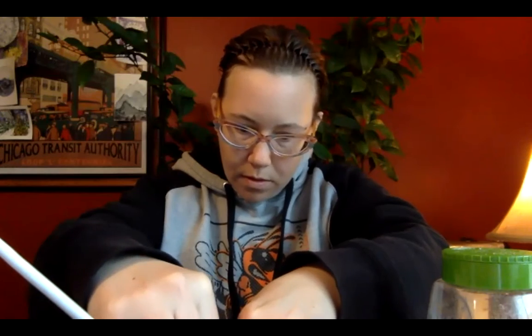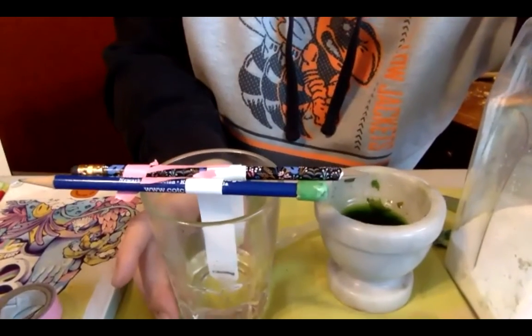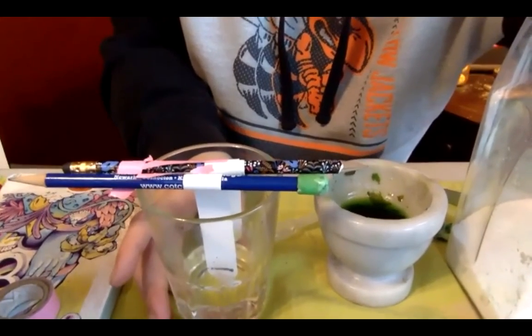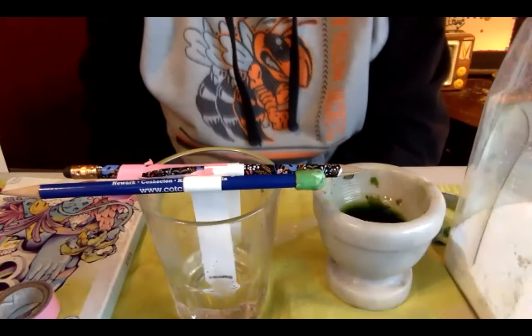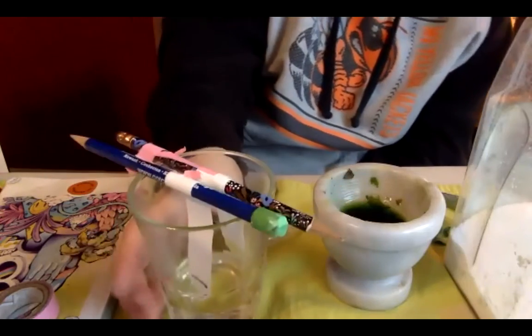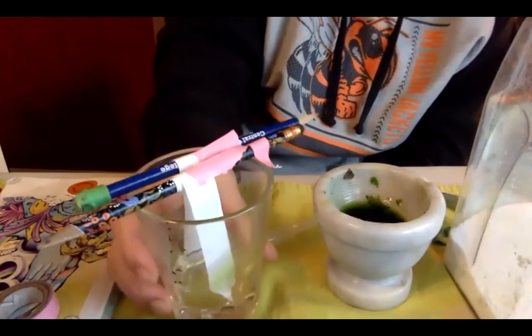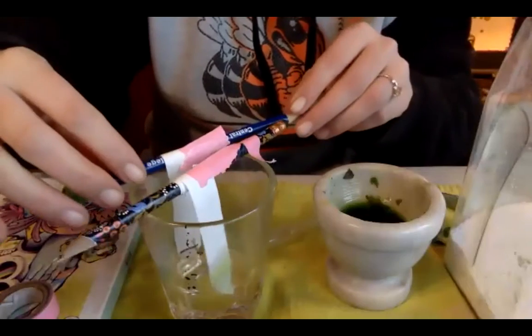There we go. You see that line okay? Yeah, the ink is not submerged, right? Right. Yeah, that's ideal, to keep the pigment. I just did a lousy job being tidy, but oh, even our plant. Ooh, oh, I didn't do a bad job. Hey now. Oh wow. It always kind of reminds me of chalk on the sidewalk that gets wet. It's very poetic.